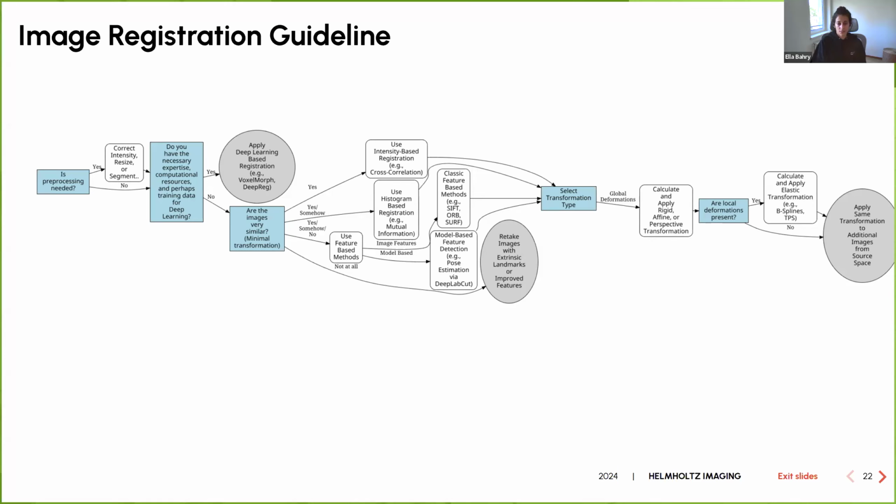And then you would see the beads once you want to register the images in both angles, if it came from light sheet microscopy, or if you took the same slide and you put it in two different sensors, like in two different microscopes, then you will be able to find those external beads, use those for an affine transformation, and then continue your registration from there.